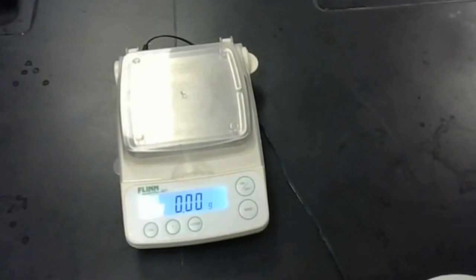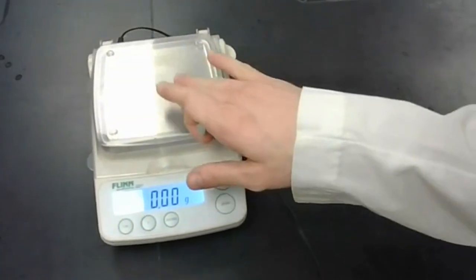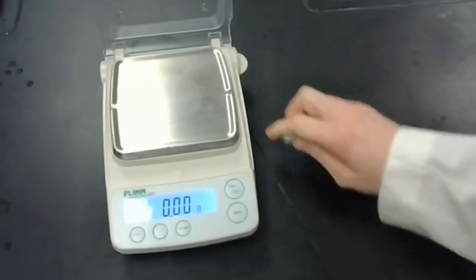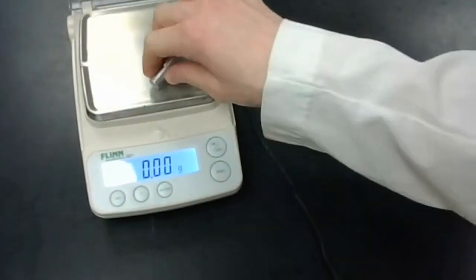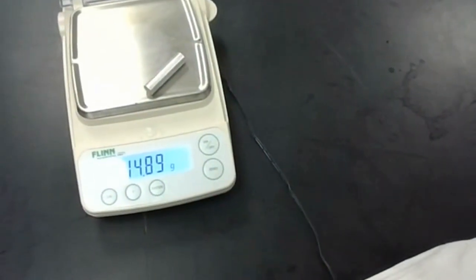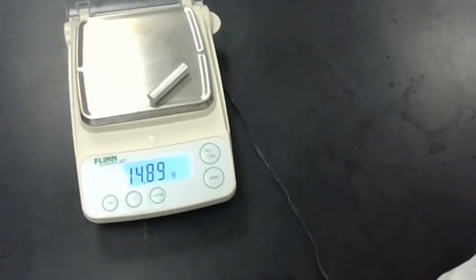And now the last part of this is just measuring that mass. This is pretty simple. All we have to do is use one of these balances. All you have to do is lift the lid, and with your scale reading 0.00 grams, just place your sample on, and you'll see this scale reads that this silver cylinder is 14.89 grams. And that's really all there is to mass.